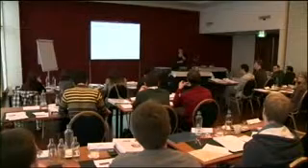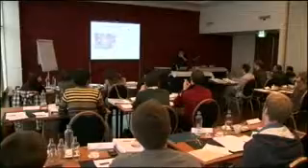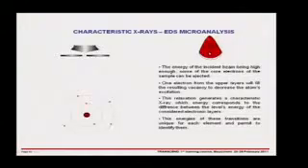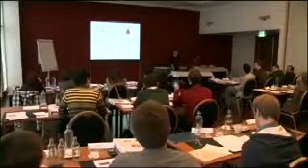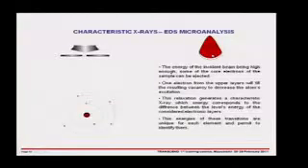Yeah? Well, you can see that kind of pear-shaped thing we drew here. So you can say roughly you've got a lateral resolution which is about half the depth resolution. And nowadays, people have got this kind of Monte Carlo simulation program. So if you really want to know exactly what's going on, you can put in the composition of your specimen. You can allow different electron trajectories, and you can actually plot that much more accurately. Oh yeah, in cementitious materials, you're talking about, say, 1 micron lateral, say 2 microns in depth.